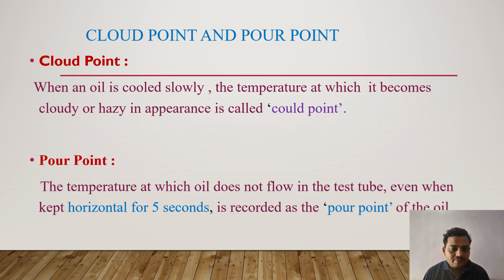First, cloud point. When we cool the lubricating oil slowly, the temperature at which the oil becomes cloudy or hazy in appearance, that temperature is recorded as cloud point.